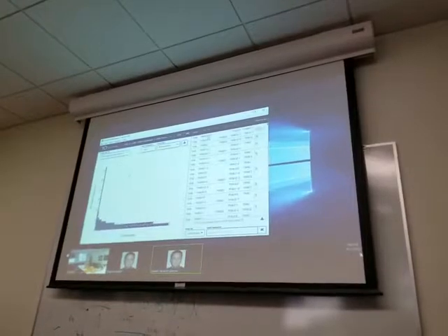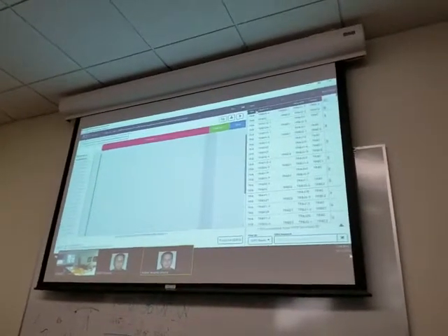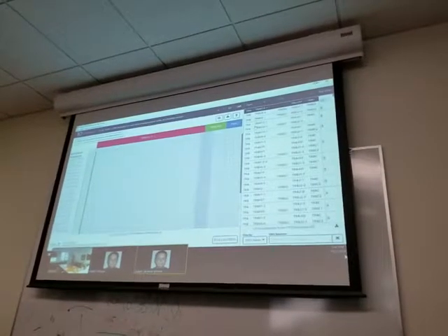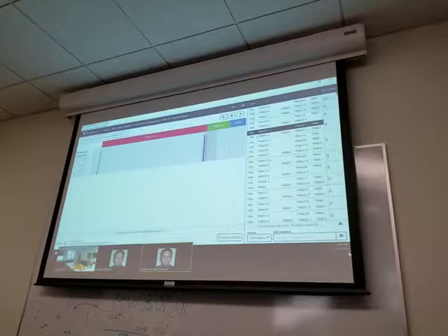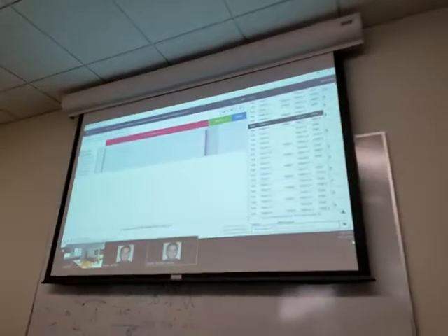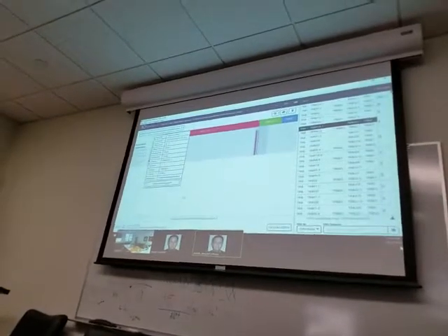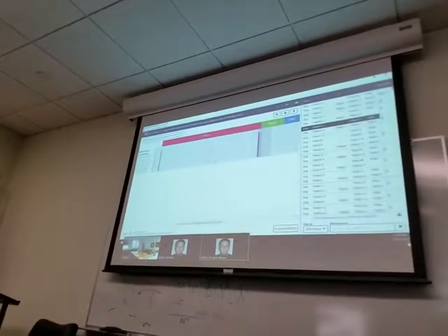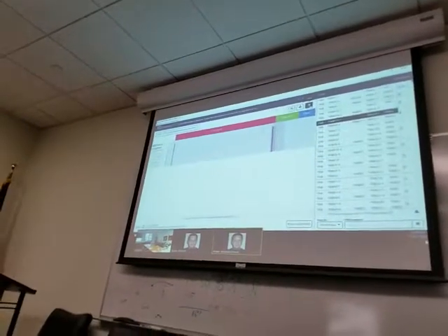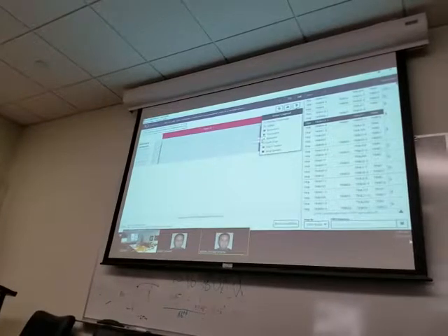One thing that you can also look at in more detail, when you click on any one of these receptors, let's find one that has, there we go. So what we're looking at is we have 6 cells that all have the same clonotype, but they all have a mutation. So orange is a mismatch. If you click the help button here, it tells you what the colors are.